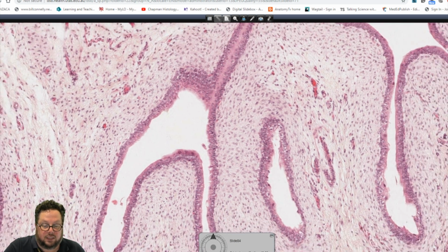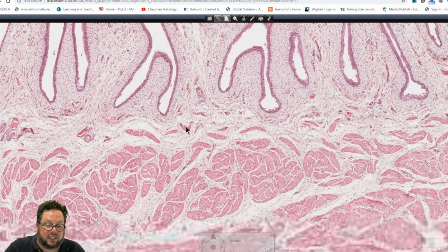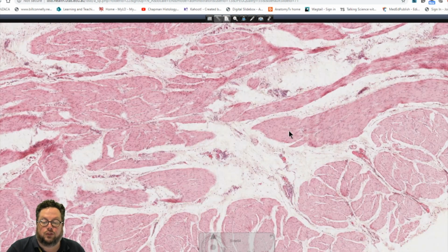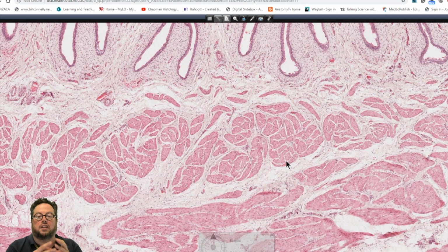So this is the mucosa. Again, mucosa consisting of the transitional epithelium, loose connective tissue, and then here's our first layer. Just so, the urinary bladder has 3 layers. Remember, this smooth muscle of the urinary bladder is called the detrusor muscle, and it consists of 3 layers in the similar arrangement that we saw on the distal end of the ureter: innermost longitudinal, middle circular, outer longitudinal layer. And you can see it's not in those nice bands which we saw in the gastrointestinal tract.